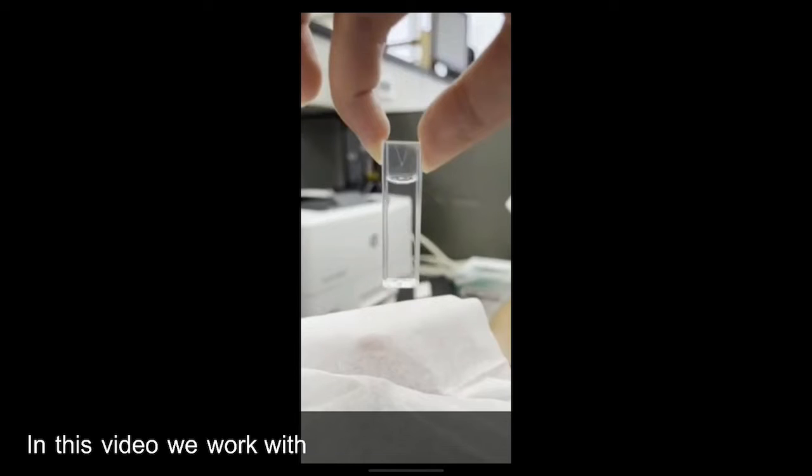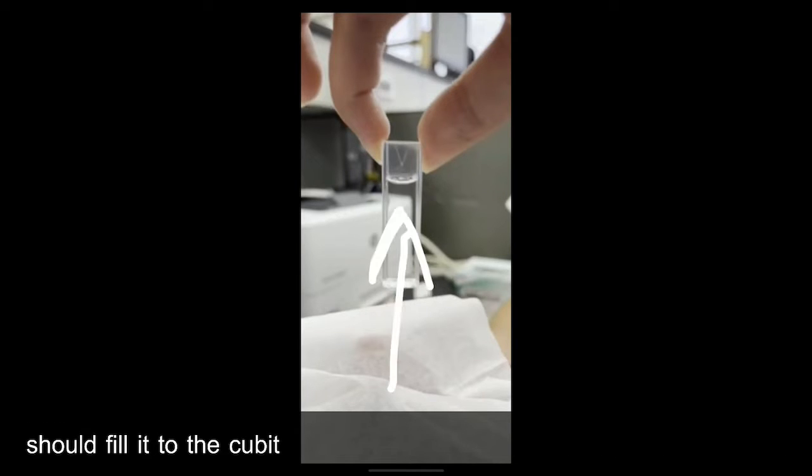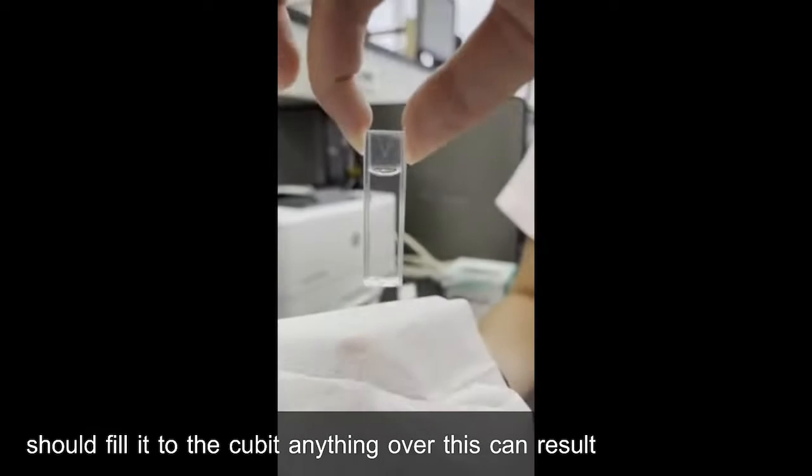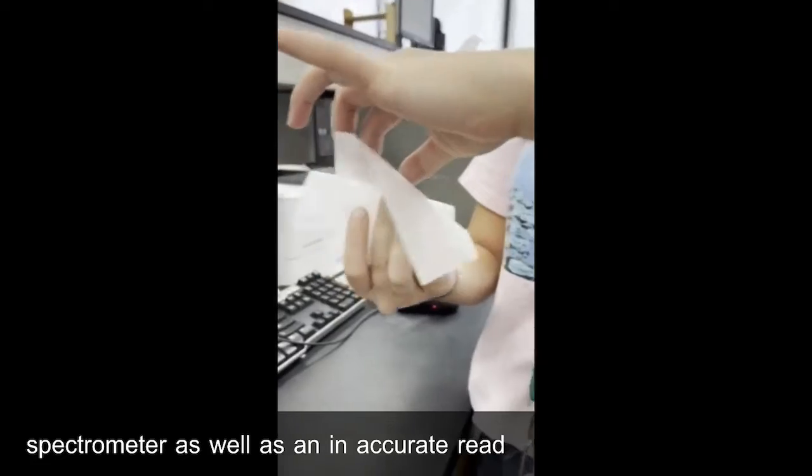In this video, we will work with spectrometers, serial dilutions, calculating absorbance and concentration, as well as understanding the graphs and data tables presented to us. Below, you will see our blank solution, which is used to clear or zero out the spectrometer. I will have an arrow that points exactly where the meniscus is, where you should fill the cuvette to. Anything over this can result in spilling in the spectrometer, as well as an inaccurate read.